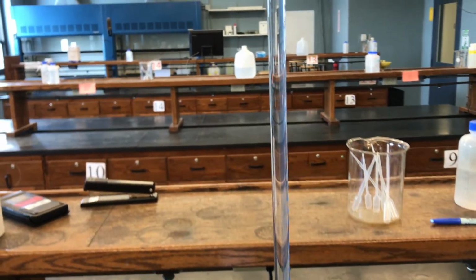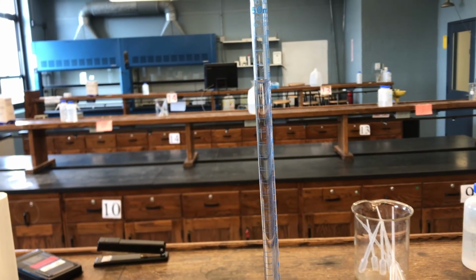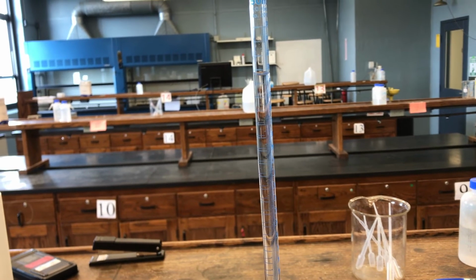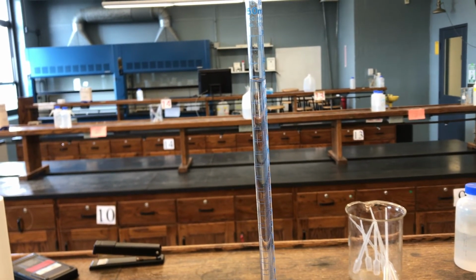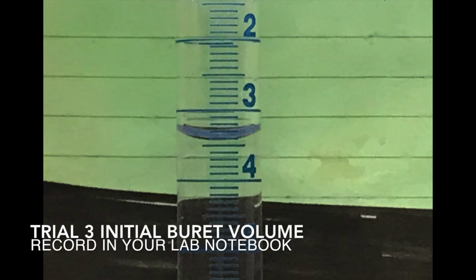For trial 3, we did have to refill the burette because there wasn't enough titrant in there, not enough sodium hydroxide. So I'm going to take a picture of that and let you read the initial volume. Now read this initial burette volume for trial 3 and record that into your lab notebook. Remember to record to 2 decimal places.